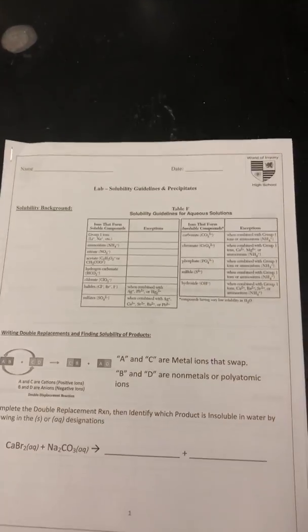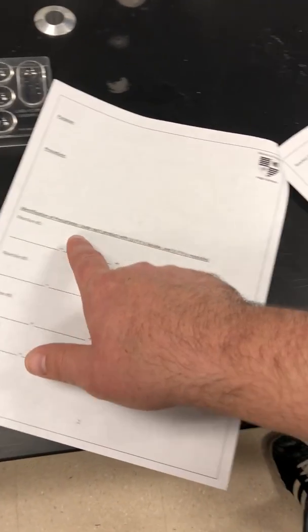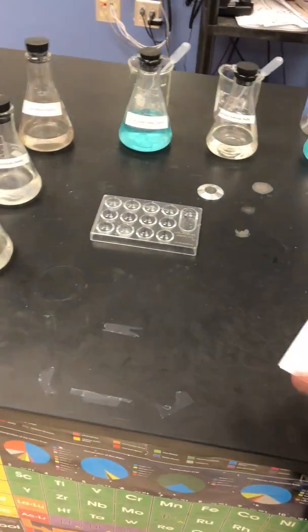So there's how you do the Precip Lab. A lot of legwork up front, filling in these chemicals in the right place in your data chart, and then taking reaction one. Oh, that's going to be this chemical plus this chemical. Figure out what the products are going to be. Figure out if they're going to precipitate or not. Do all that legwork up front, and then the actual lab piece is easy.